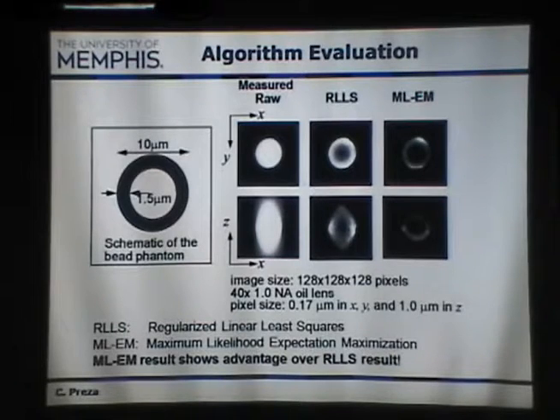So that's the point that I wanted to make here with this test sample, to just highlight the fact that yes, you can get a lot better result. So this result shows an advantage over this more complex methodology. Recognize that this takes more resources, both in terms of memory and computations, okay?